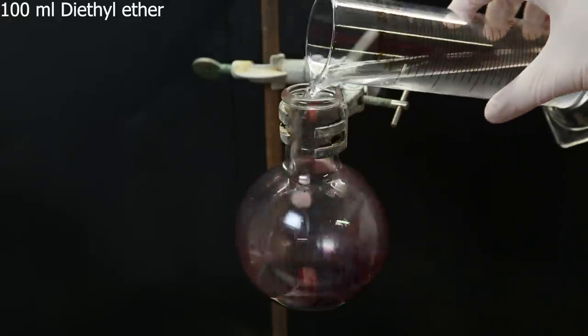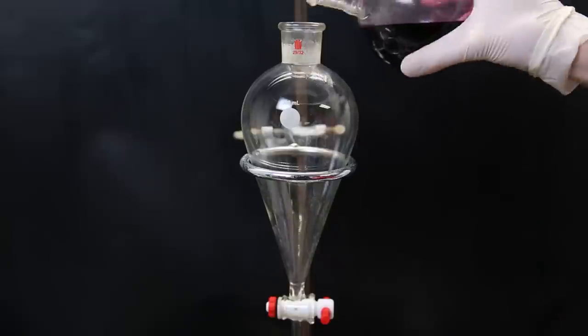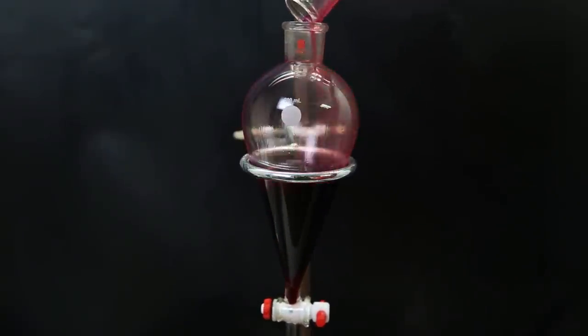Now this mixture still contains a lot of impurities, so I dissolve it again in 100 ml of diethyl ether. I move it back to the separatory funnel, and wash the flask once with some more ether.